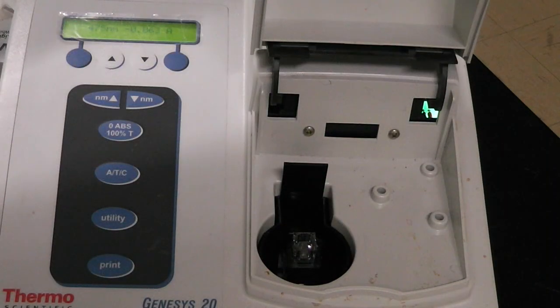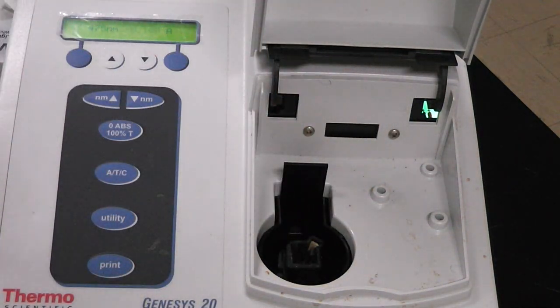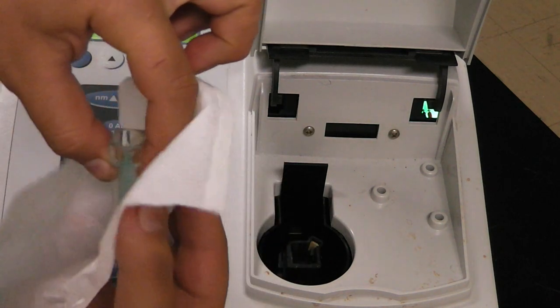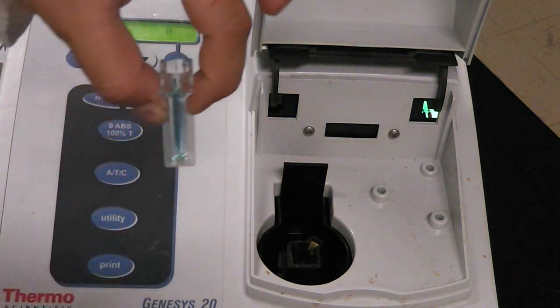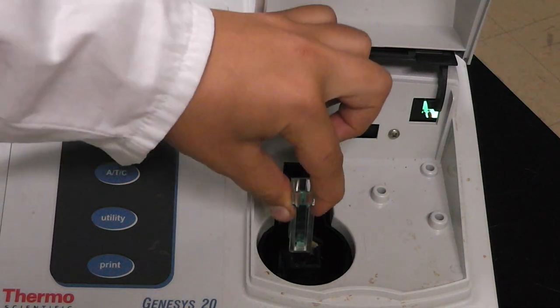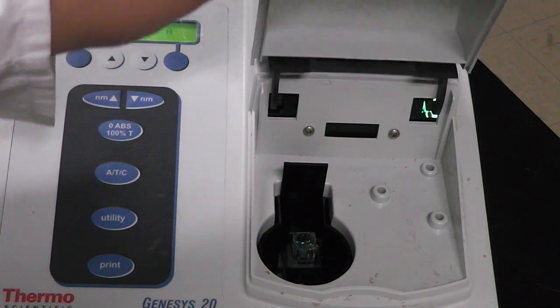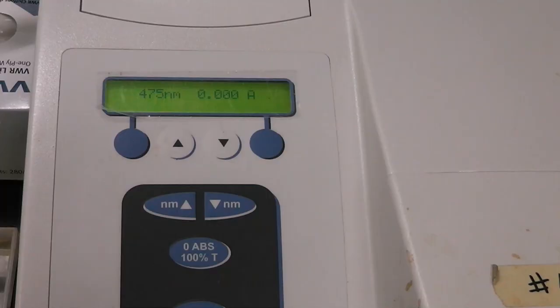Without adjusting any settings, simply take out your blank, holding the opaque side, of course, and insert your cuvette with the solution of which you'd like to take the absorbance. Make sure that you take a Kim wipe and wipe the transparent sides of the cuvette to make sure that there are no smudges or drops of solution on the side. And again, place it in the machine, facing the correct way, and close the door.